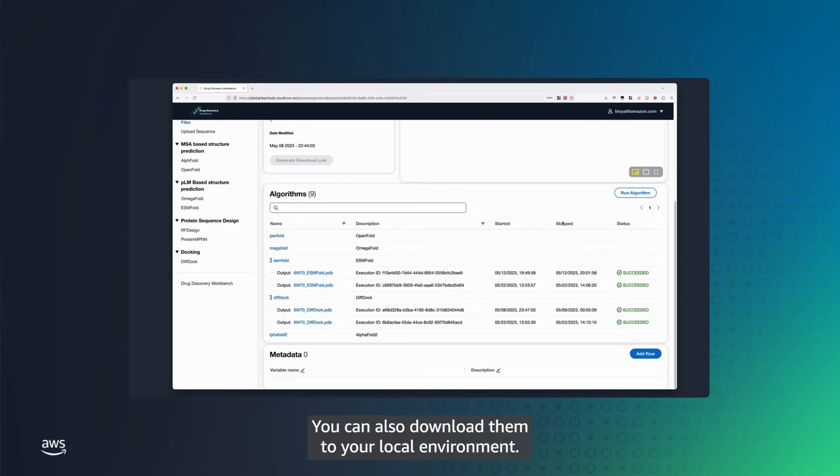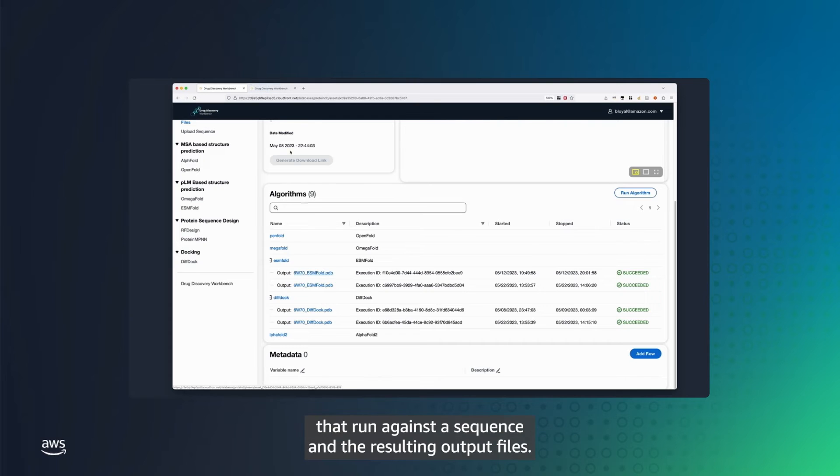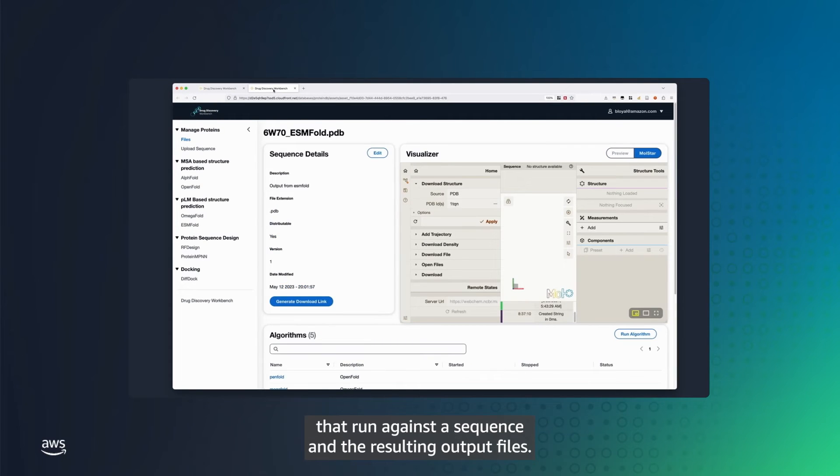You can also download them to your local environment. The Workbench also lists the algorithms that run against a sequence and the resulting output files.